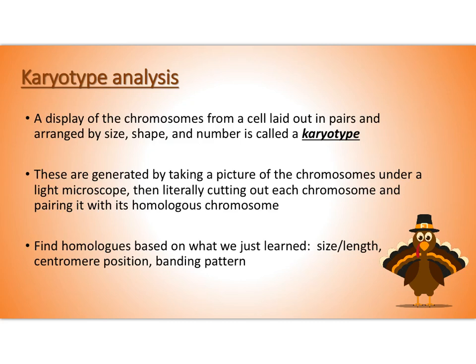So, what is this whole karyotype thing? A karyotype is really just a picture, right? A karyotype is a picture of all of the chromosomes from a cell arranged in their pairs so that you have a nice little organized view of the different chromosomes.